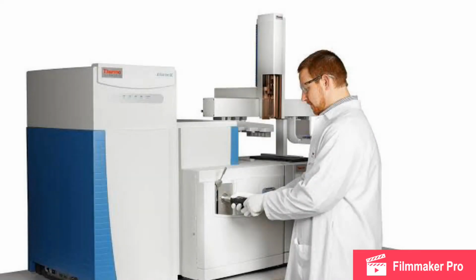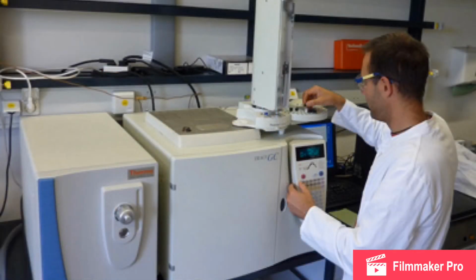And gas chromatography teamed with mass spectrometry is also another useful method which can determine the components of a given mixture using the retention times and the abundance of the sample. This method can be applied to many pharmaceutical applications such as identifying the amount of chemicals in drugs. Moreover, cosmetic manufacturers also use this method to effectively measure how much of each chemical is used in their products.